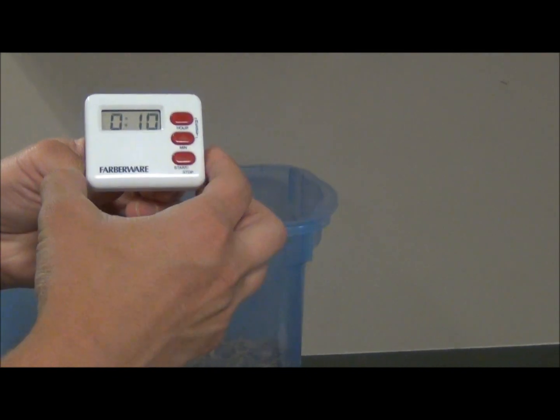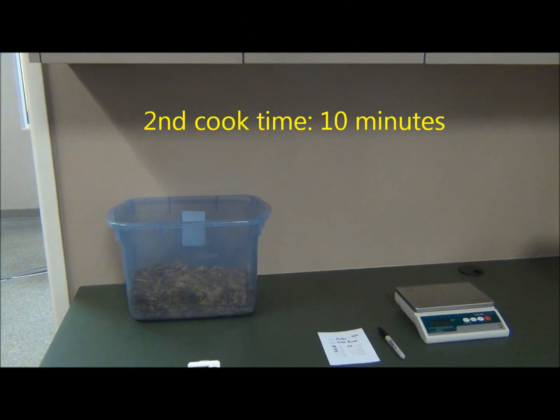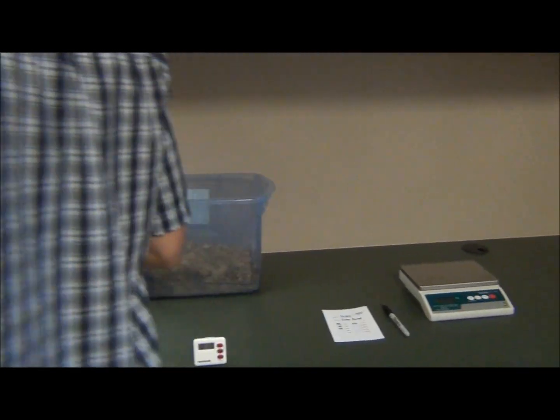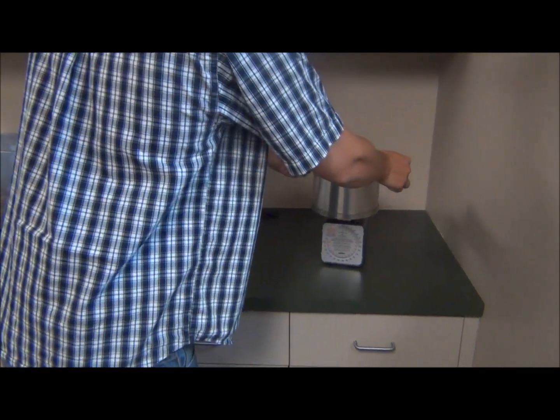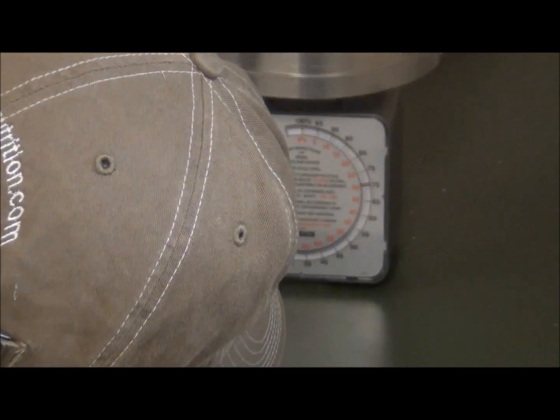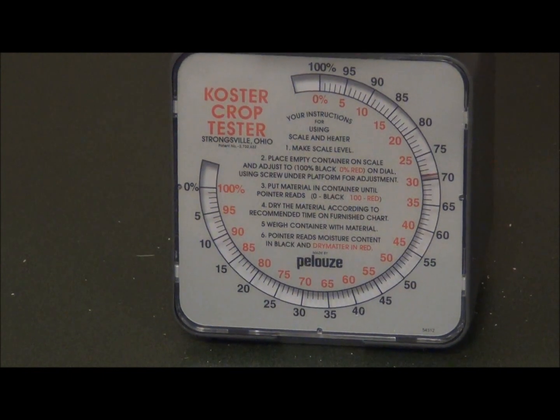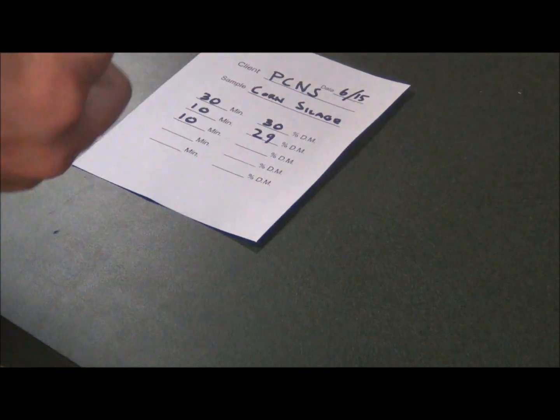Return the sample to the evaporator and cook for an additional 10 minutes. Continue 10 minute intervals until two samples in a row are the same dry matter. The second reading in this case is 29%, indicating 29% dry matter. Record the 29% on the data sheet associated with the second cook time of 10 minutes.